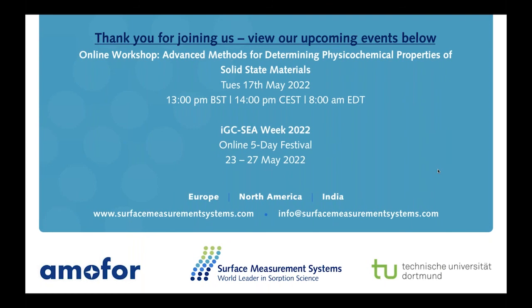Thank you. Another question from the audience: for surface energy, would you recommend using the Dorris-Gray or the van Oss-Chaudhury-Good scale?